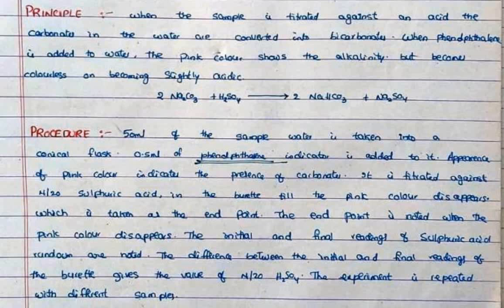It is titrated against N/20 sulfuric acid in the burette till the pink color disappears.